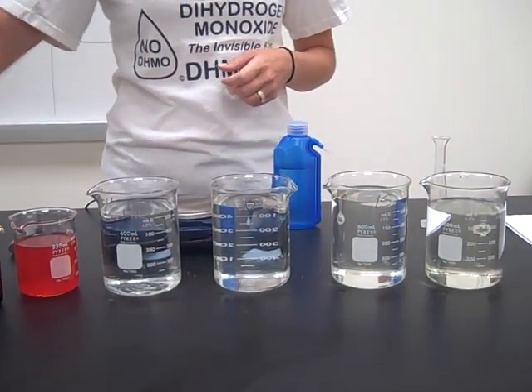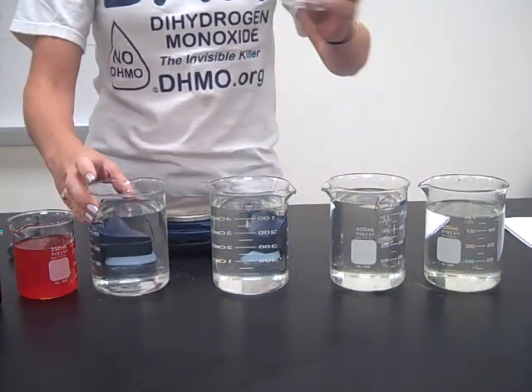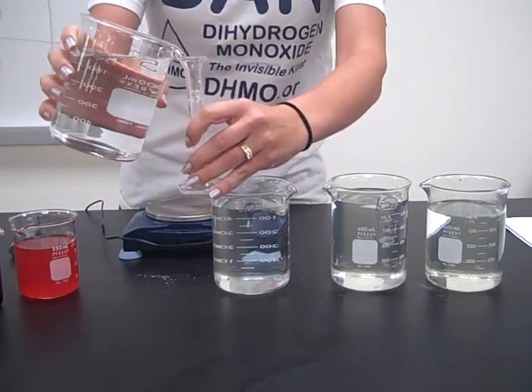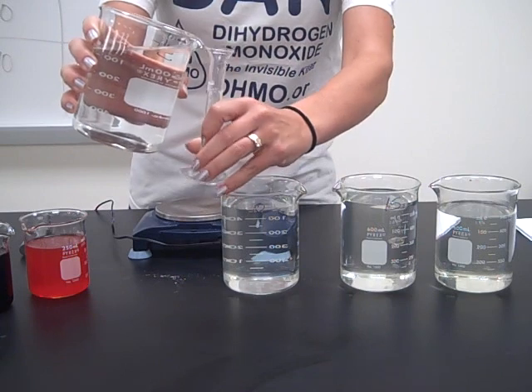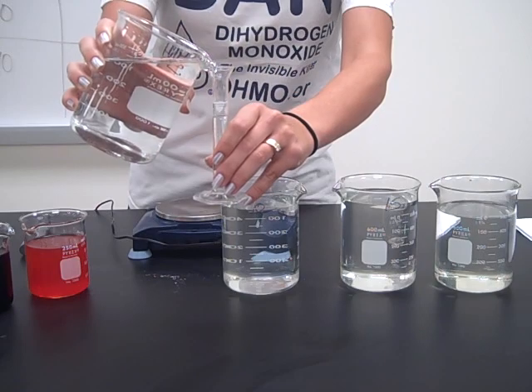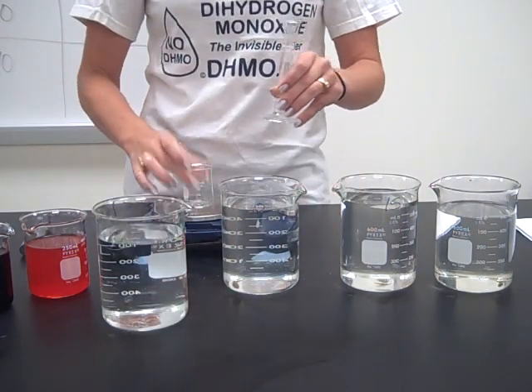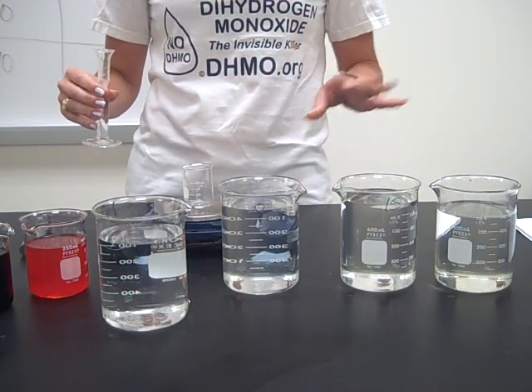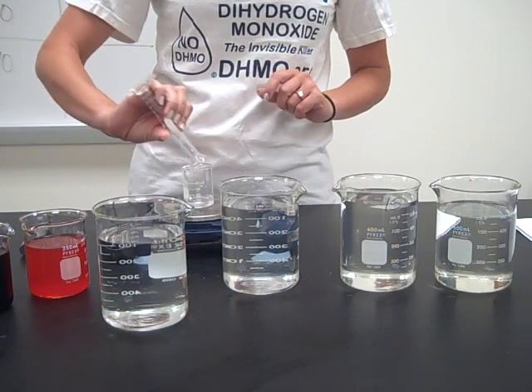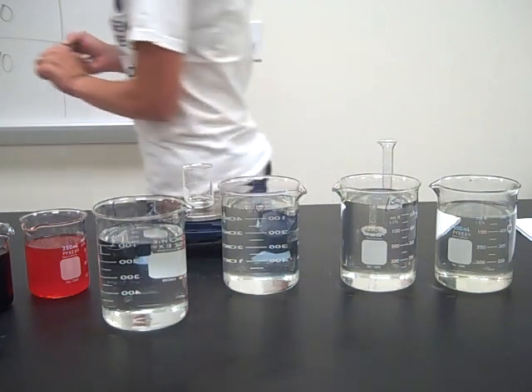Now we can dump that down the sink and move on to our 5% sugar solution — 10 milliliters again. I don't need to rinse this out because all I had in it before was distilled water. So I'm going to get 10 milliliters, pour that in, and make sure it zeroes out. This one has a mass of 10.61 grams.